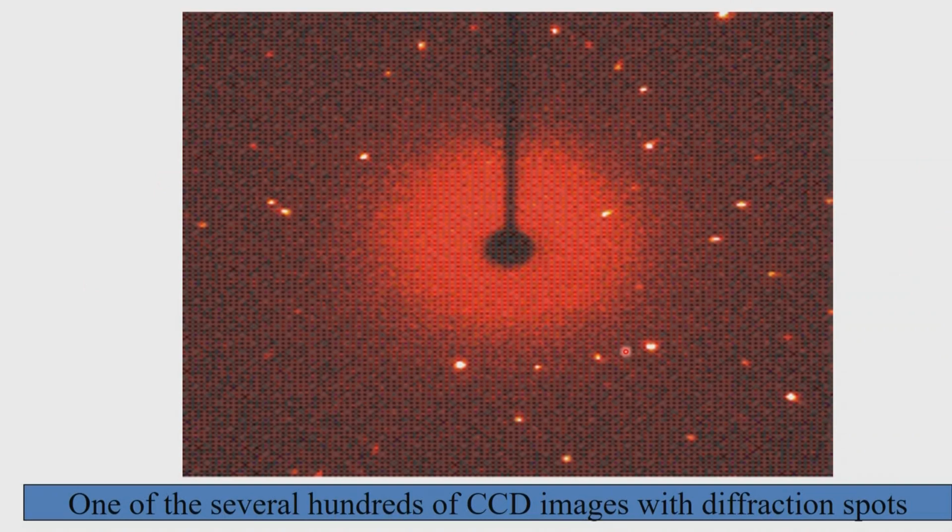In the case where the cell dimensions are very large, you see the spread becoming closer and closer. So, the larger the cell dimensions, the spacing between these spots will be much closer. So, it is a reciprocal relationship. If the cell dimension is 100 angstroms like in a protein, then these spots will be very close to each other, whereas in this case it looks like data from a not so strongly reflecting material, and at the same time a smaller unit cell dimension.